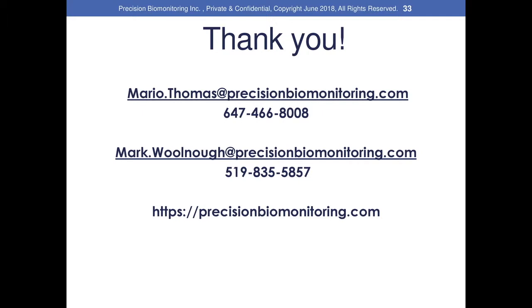We've also done summer surveys of turtle activity in Nova Scotia, where there is a highly divergent population of Blanding's turtle. Our assay works in both Nova Scotian populations and Ontario populations. And in both cases, we got very nice levels of detection. The wood turtle surveys we just performed last December, and we've got nice occupancy estimates, again from working with local conservation groups who have known occupancy data from conventional methods.